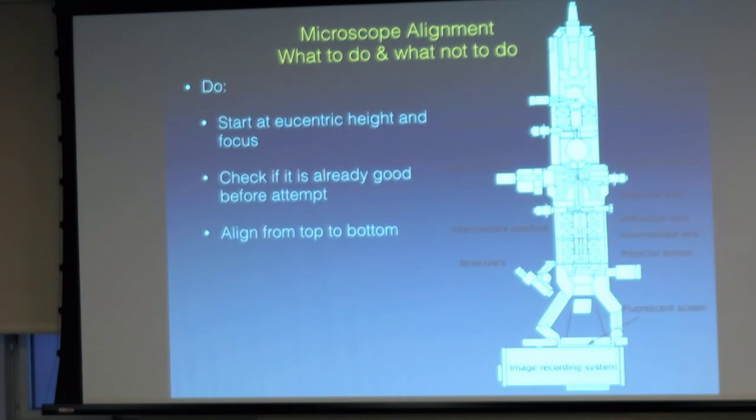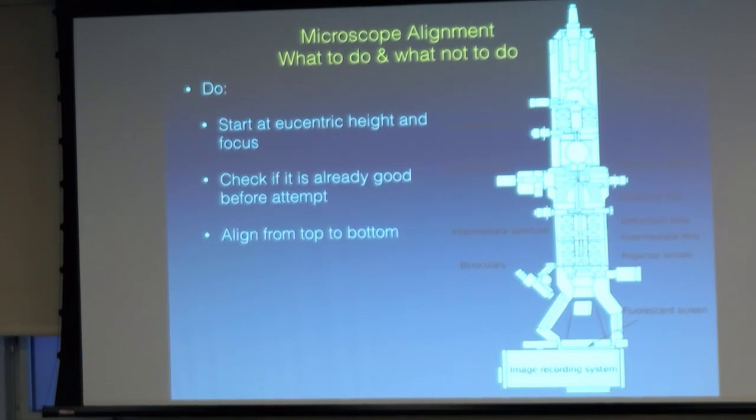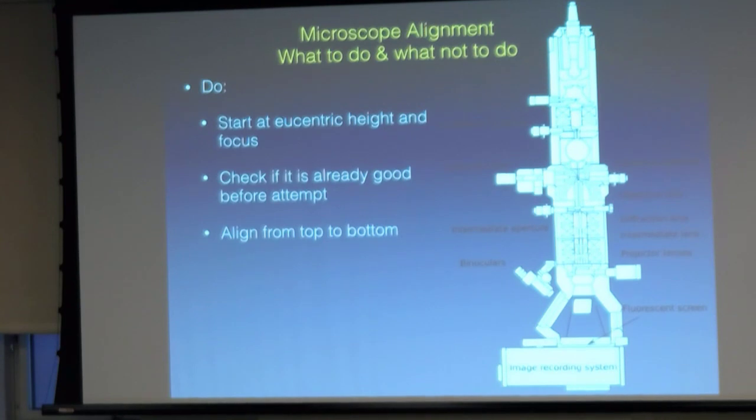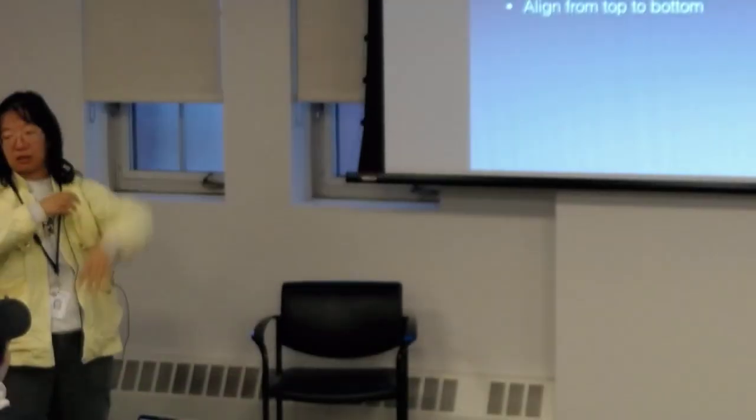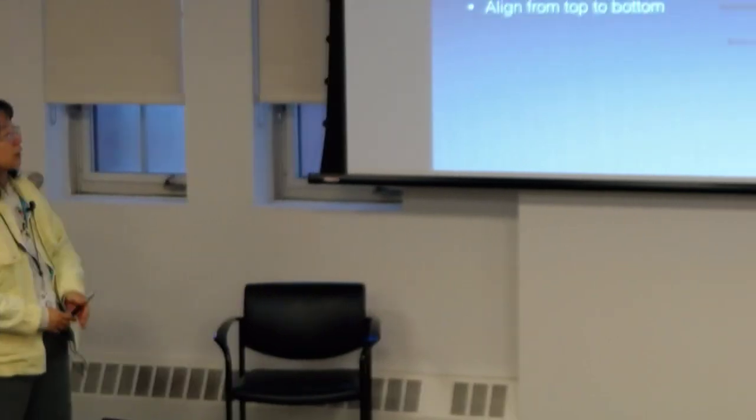So what you would do at the very beginning is tilt that, make sure things don't move, and then adjust your objective system to have the image focus right at that point. That's your reference point. That's where the factory did it. So if you are doing it yourself, you should make sure you are at that point before you start messing around with everything. So that's the first thing to do.